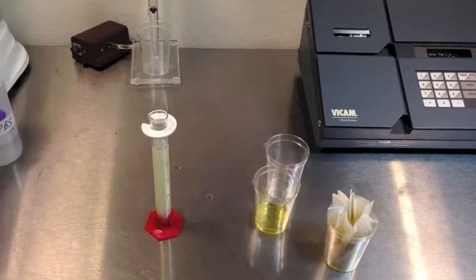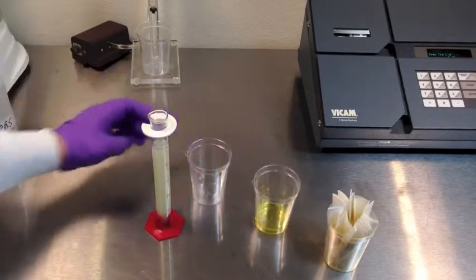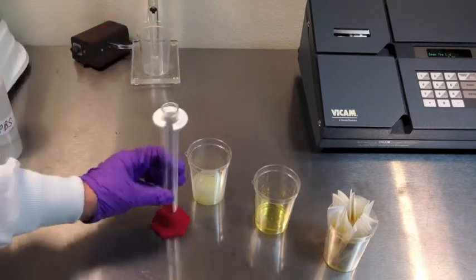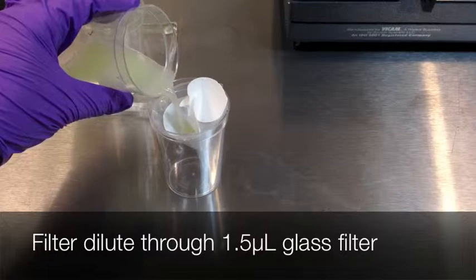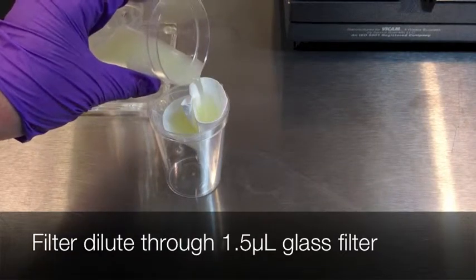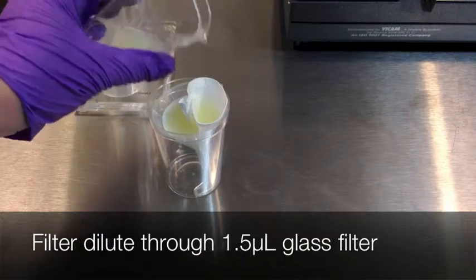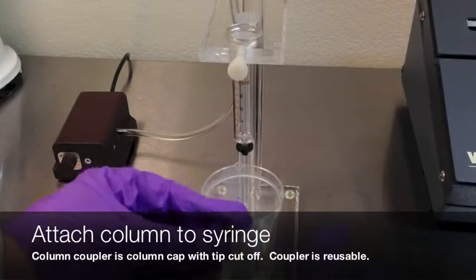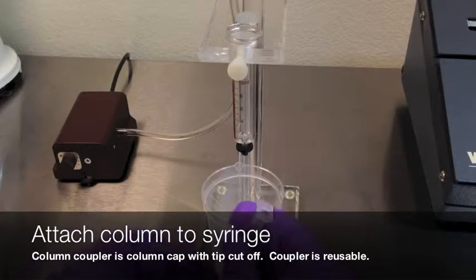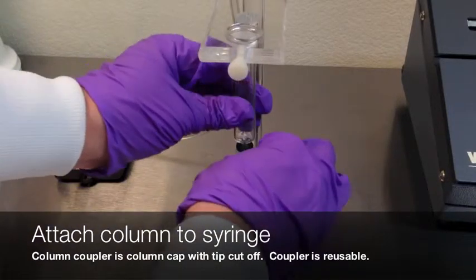Pour the filtered extract with 40 milliliters of the PBS solution. Mix well by pouring back and forth into a clean collection cup. Filter the diluted sample through a microfiber filter into a clean collection cup.